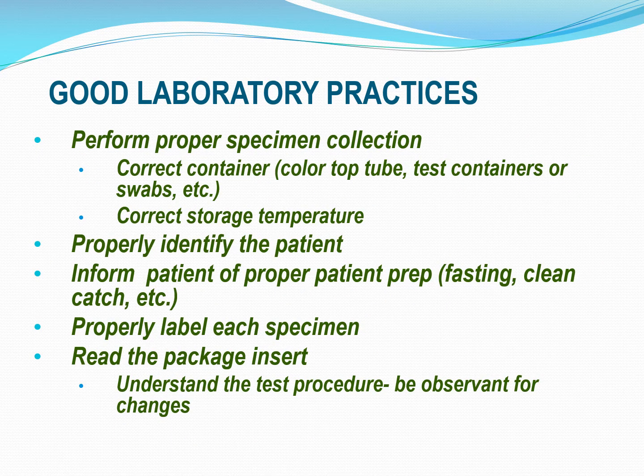So you want to perform proper specimen collection. Because the things you need to keep in mind is, that's why I say, I don't care if you've been using this kit for the past year. Each and every time you open up a new kit, you need to look at it, you need to pull the package insert out, and you need to look over that package insert, because from time to time they will change something on you. And you don't want to be running the new kit on the old kit's directions when something's changed. It could affect your results.